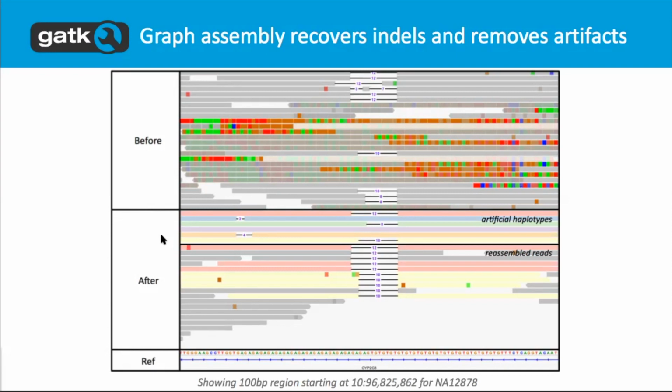But this requires looking per section of the genome and actually doing all that reassembly. It is a lot of extra work. When we originally came out with this tool, it took much longer to get variant calls compared to traditional callers. People were actually slow to start using the tool, in part because it took so much longer to run.